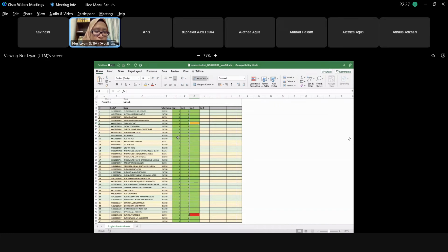Edward Kwek Junji. Morning, doctor. Good morning. Okay, according to Dr. Faisal just now, he mentioned that there are how many elements that can be detected by using this AAS? According to the video, it's 70 plus. 70, yeah, 70 elements that can be determined by using the AAS equipment. Thank you, Edward.